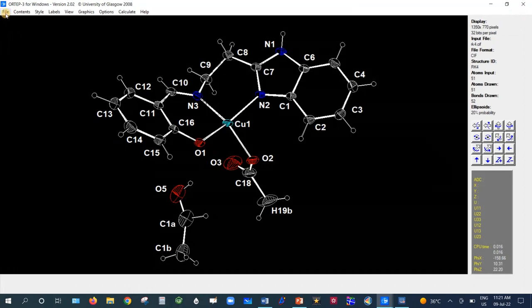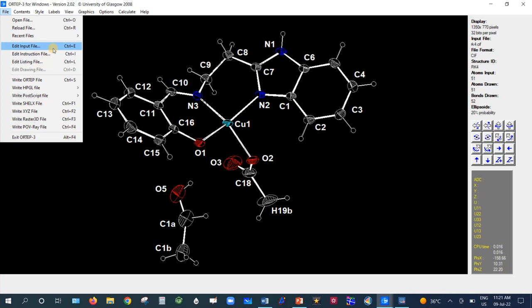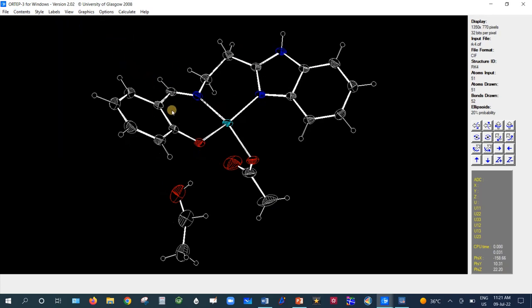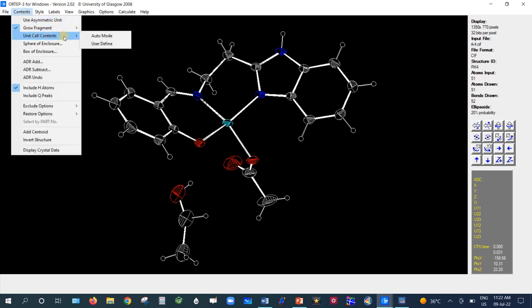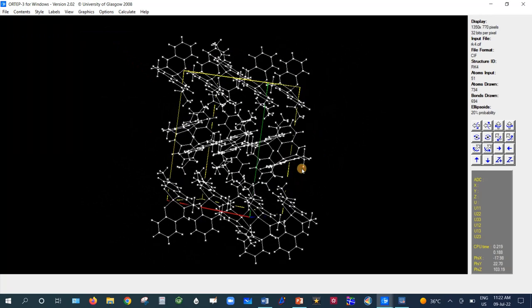Other options are available under File, including Edit Input File, where you can edit the .ins, .res, or .cif input file. Under Content, there is Use Asymmetric Unit — here the asymmetric unit is the complete molecule. There is also Grow Fragment in automatic or user-defined mode. For Unit Cell Content, selecting automatic mode will grow the unit cell and you can view it along different directions.